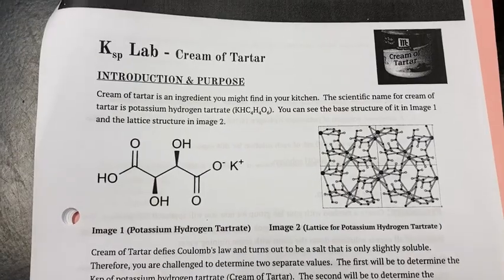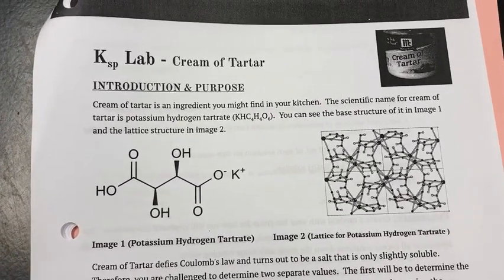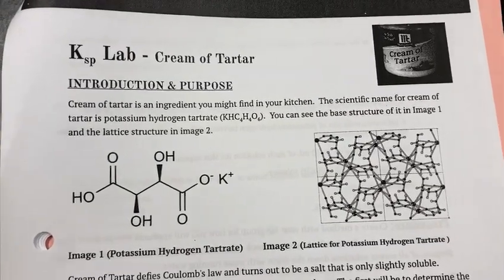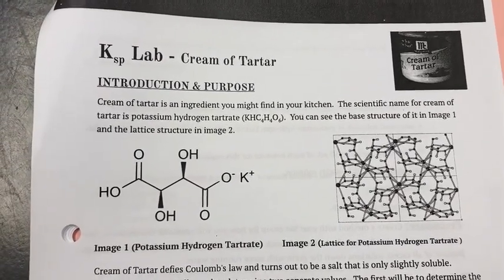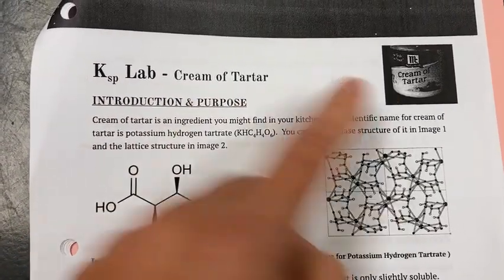Welcome back to Lab AP students. Today we are going to be figuring out the answers for the KSP lab, and we'll be figuring out the KSP for cream of tartar, which you can get from the stores.